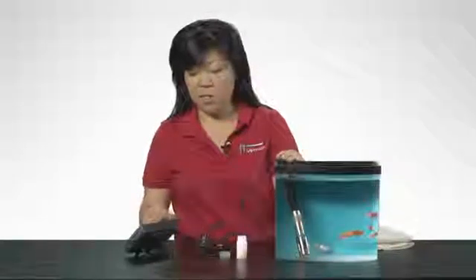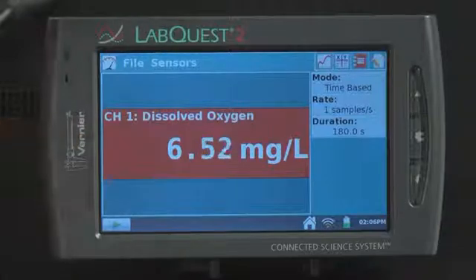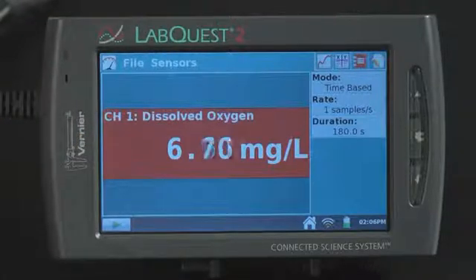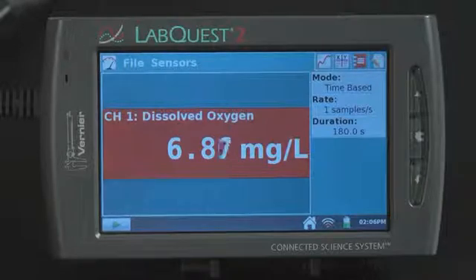The reading of this fish tank is approximately 6.4. It will take 40 seconds for the DO probe to reach 90% of its final value. So you may want to wait a few minutes for this value to stabilize.